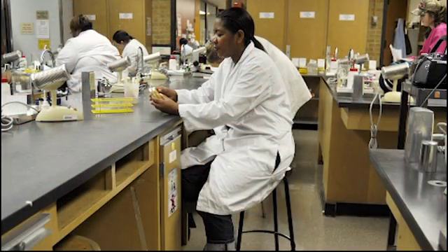Rule number 6 requires you to wear an appropriate lab coat which should extend below your waist and has sleeves to protect your clothing. In order to protect your legs from spills, it is also strongly recommended that you wear pants or a dress that covers your knees when seated. Shorts that do not cover the legs are no longer allowed in the microbiology laboratory.